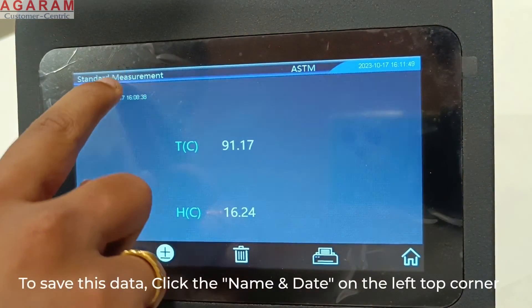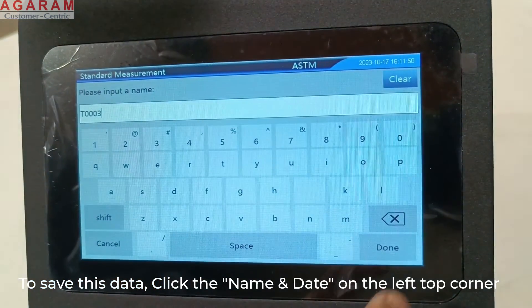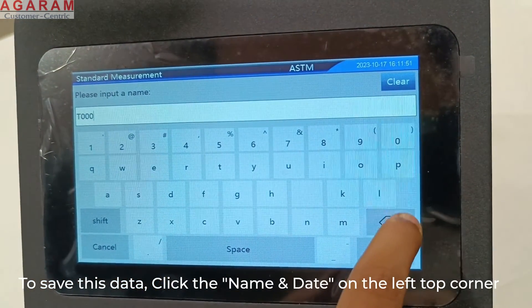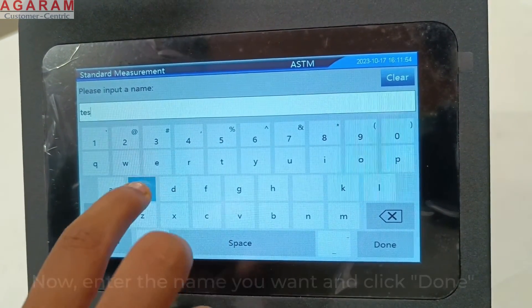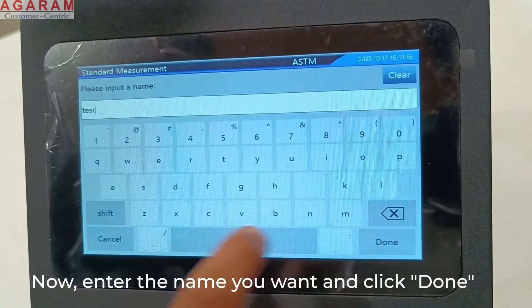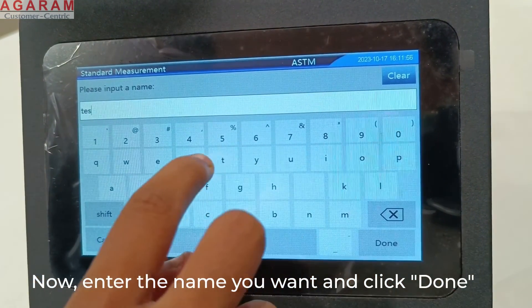To save the measured value, click the name and date stamp on the left top corner and key in the name of your choice.